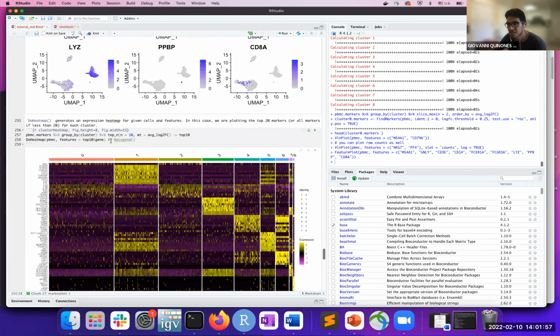Here I made a little update to the code. I put a comment here so this part doesn't run. This is just so that we can see again our clusters and the values for the different colors. So please go ahead and run this cell.